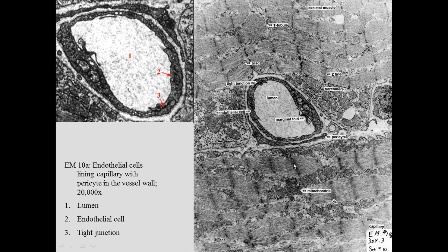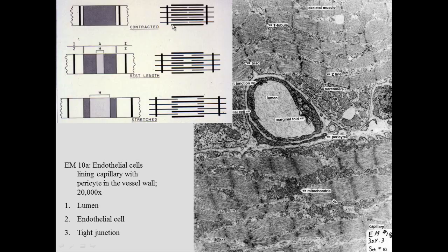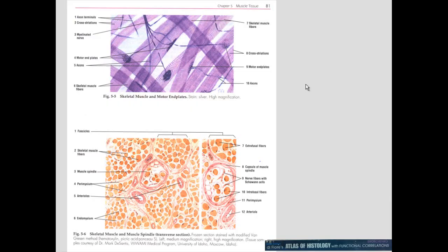And here we can see some hypercontracted muscle. That's where the A band would be, and the I band would be there too. There's your Z line. The Z line's in the middle, of course. In this case, you can hardly see the A and I band because it's so contracted, and so one sarcomere is from here to there, another one from there to there. And remember, these different bundles of fibers are organized by intermediate filaments.